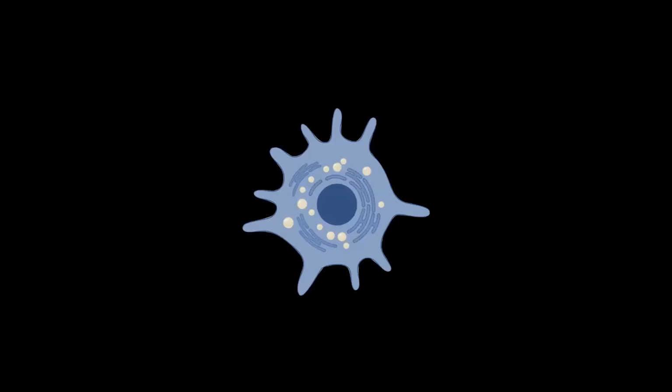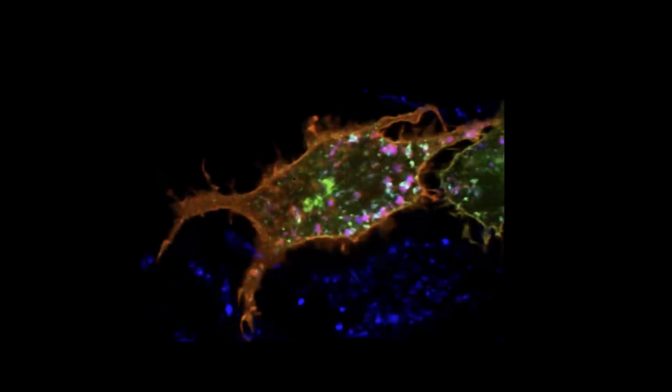The main reason we're talking about these advanced tools is because when we come to do biomedical image analysis, maybe especially when we're first starting out, but even when we've been away from it for a while and come back to it, we have this idea of, okay, I'm going to analyze some organelles or maybe some cells. We think maybe it'll be easier than it is, but we start to do the imaging and immediately we realize just how complicated it can be.